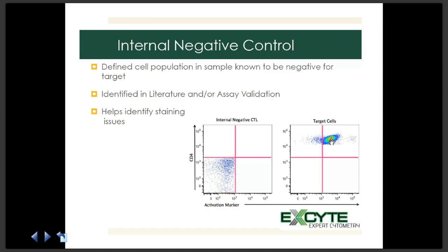It's not always easy to find one of these, but if you can, it's a really useful tool. And it's what you look for as you're developing your assay. Any place where you feel, again, rare events, emergent dyes, etc., where you're going to be able to get better resolution by having these, you should use them.